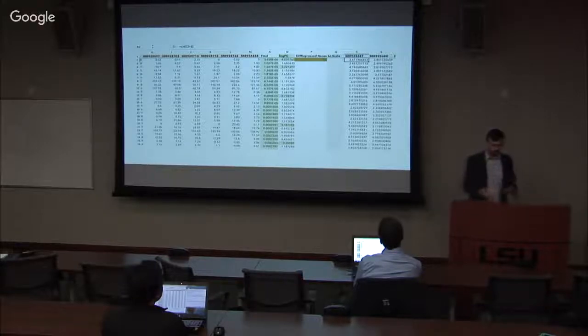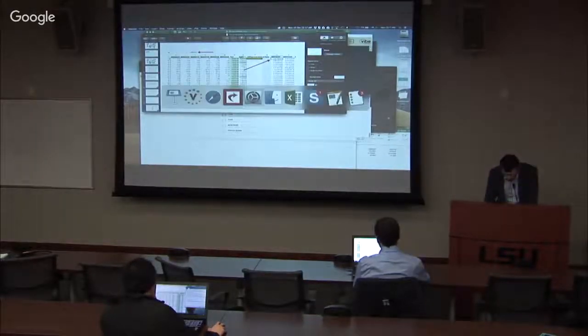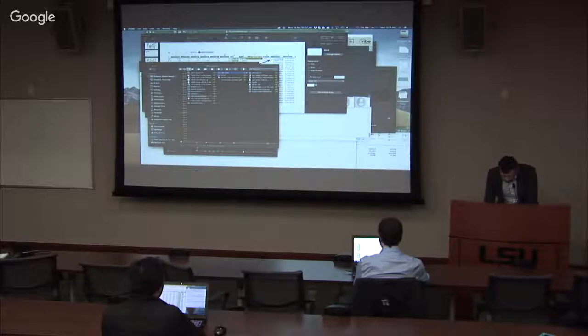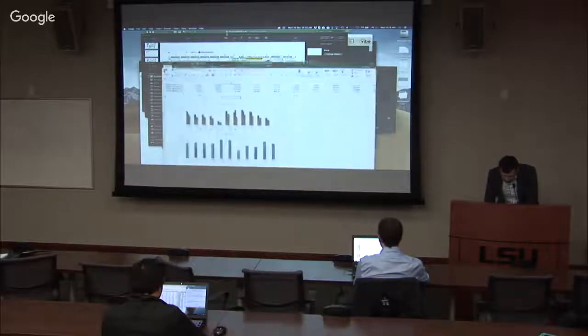And we'll talk a lot about why this is important, but if you want to follow along and see what that looks like in the data itself, in the folder you have this file called cell lines expression genes.